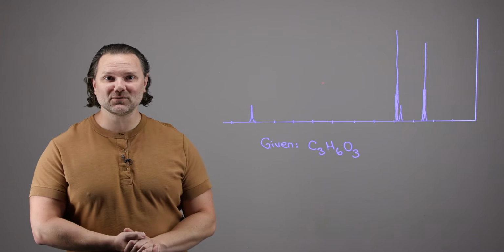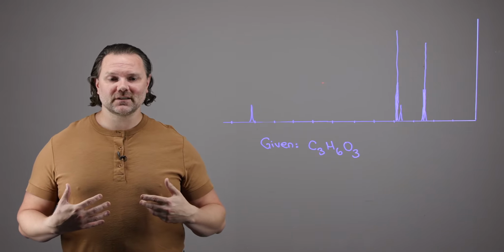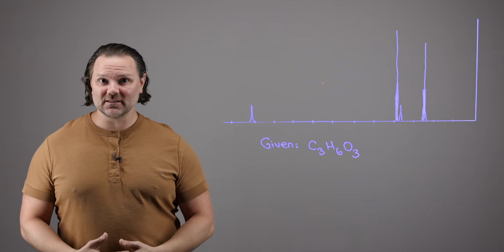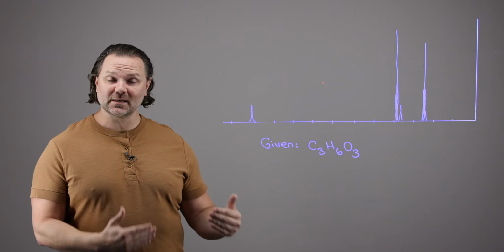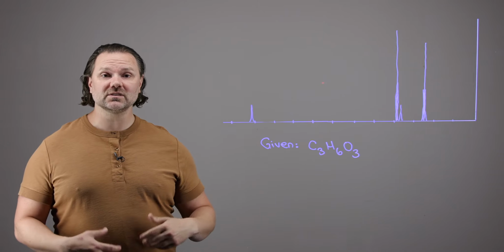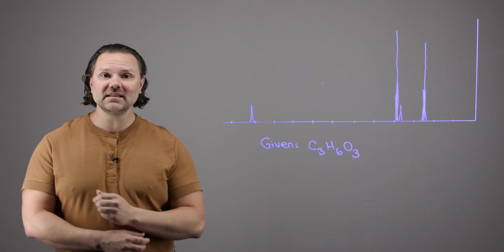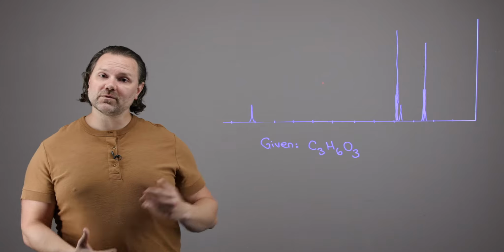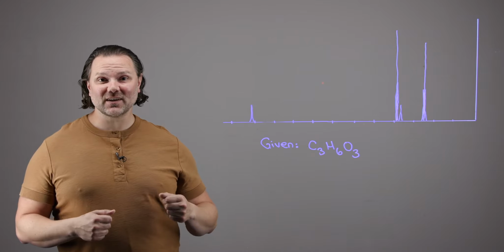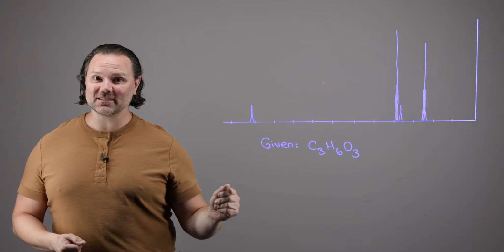Okay, now we're ready for a slightly more challenging example. Don't worry if you're finding it frustrating as you work through NMR. This is normal. Everyone feels frustrated as they start learning how to solve these types of problems. Keep at it, because it might just take you another week or two with sufficient practice to start to see the patterns and be able to look at a spectrum and immediately start to recognize what information is available to you. I hope that you, like me, are soon going to find that these are fun. These are really enjoyable to solve. So let's get into this one together.